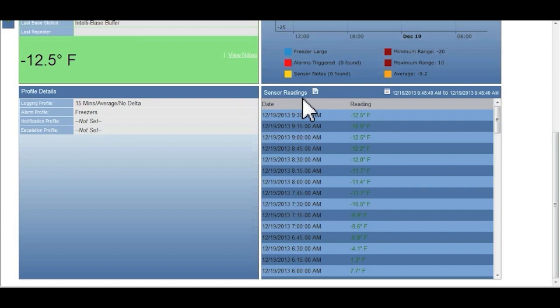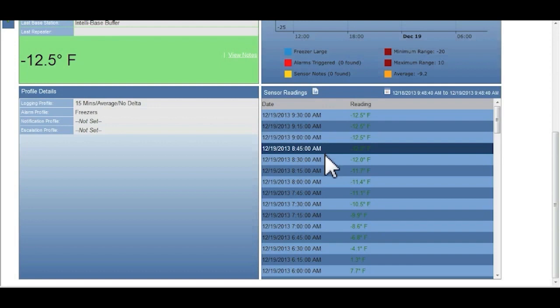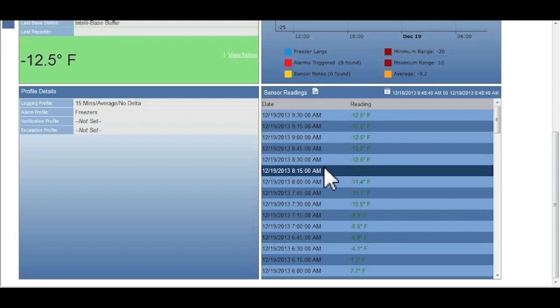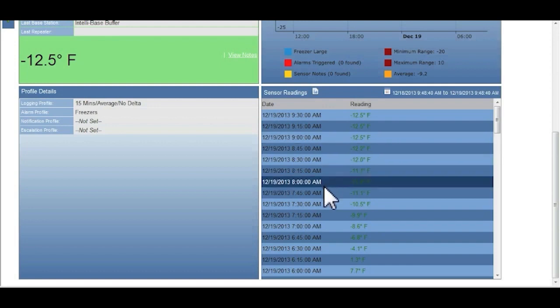In the lower right hand corner is a listing of all the readings taken for this piece of equipment within the last 24 hours.